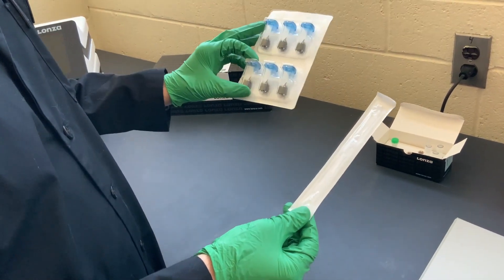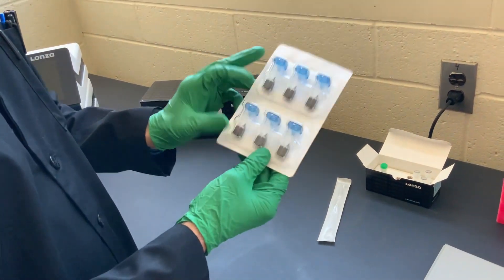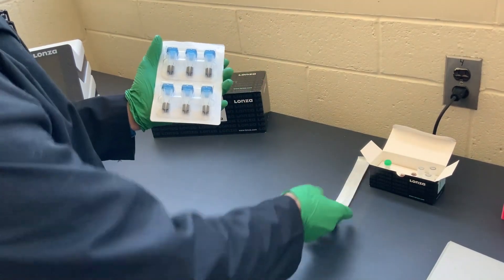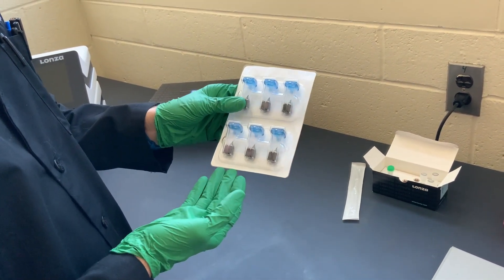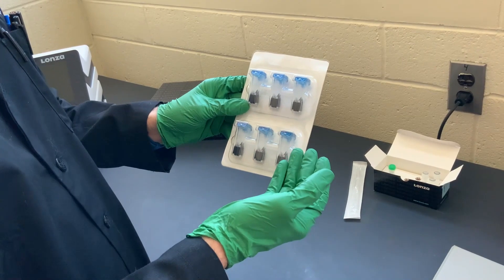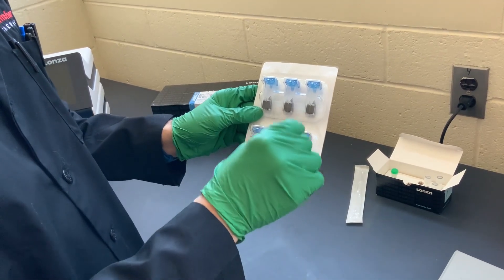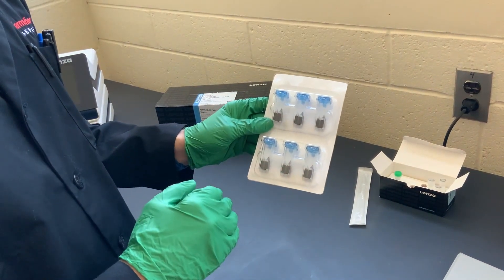These micropipettes are very important to use because standard pipette tips do not fit into the nuclear cuvettes that are included. So you will actually need to use either these or other sterile pipettes you have in your lab. These are the actual apparatus that you'll be placing your cells into, and they come in sterile packages. This version is for single nucleofection — you use one cuvette per experiment, but this is a very low-throughput method.